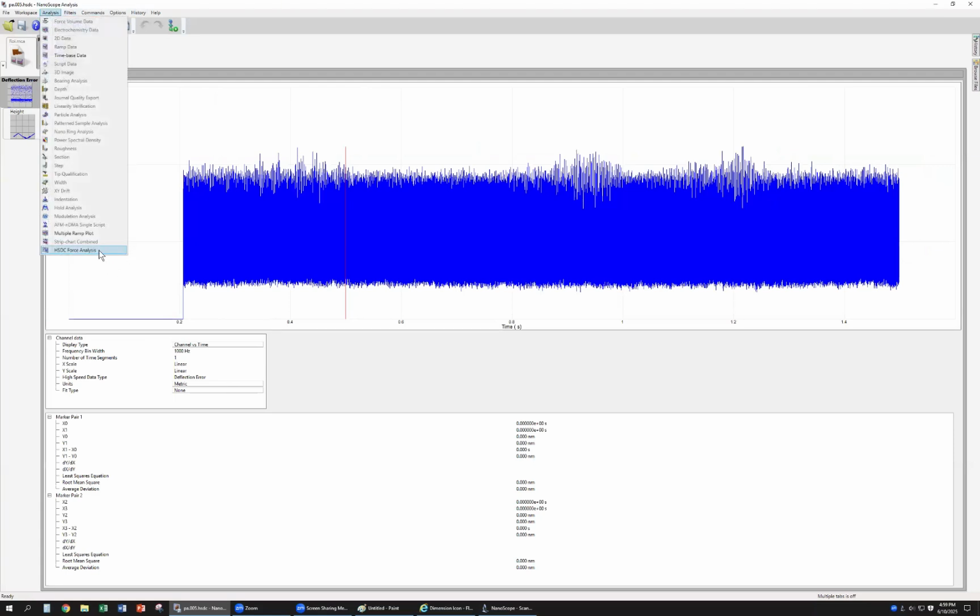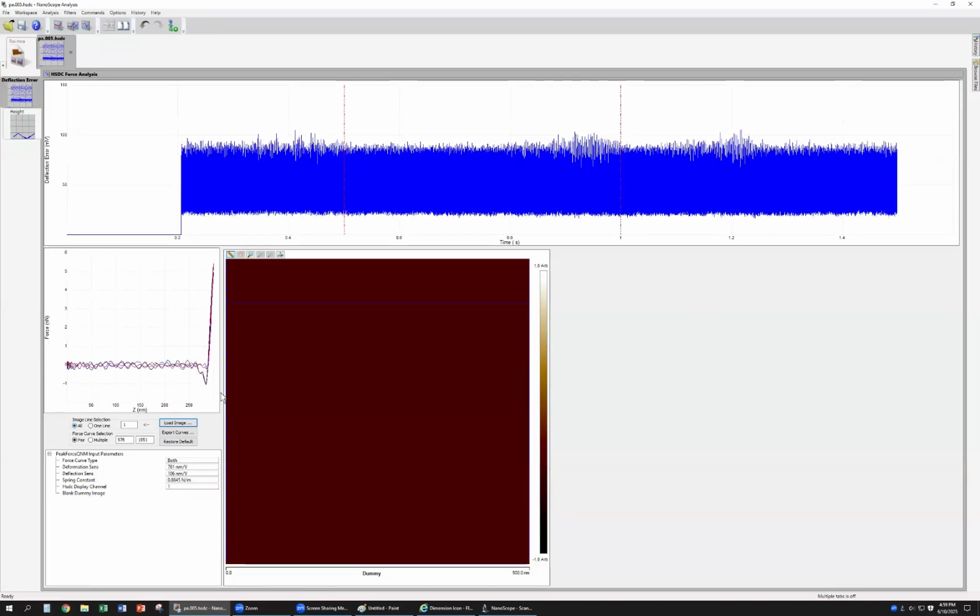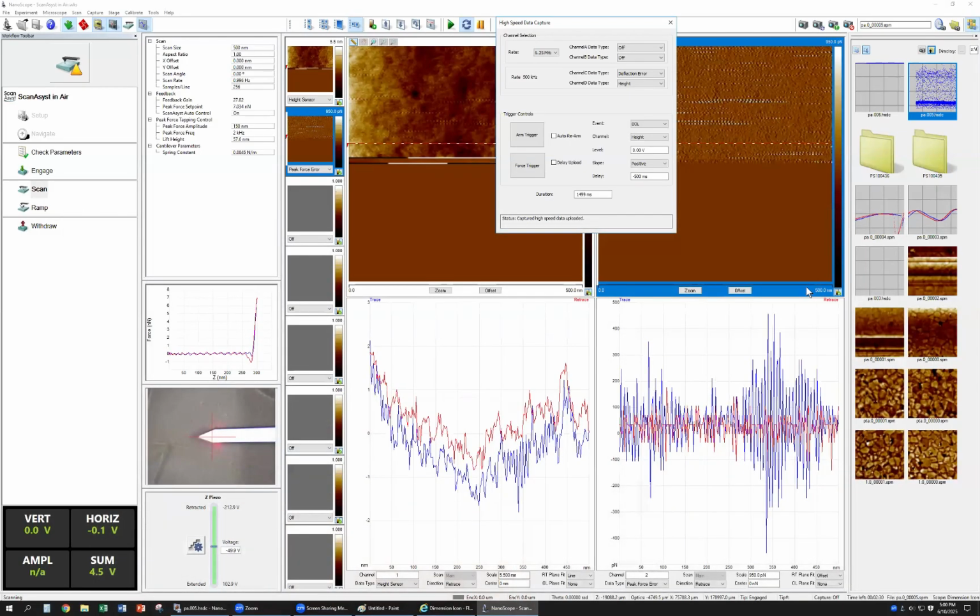Okay, so for this one you get all the force curves. At here you can use this to retrieve all the force curves you collected on this scan line. For example, at here I can see all the force curves at this side. For example, I use 1095 one. All the force curves here. If you export, that's each point's force curve collected. So this is one method to collect more force curves at one time.